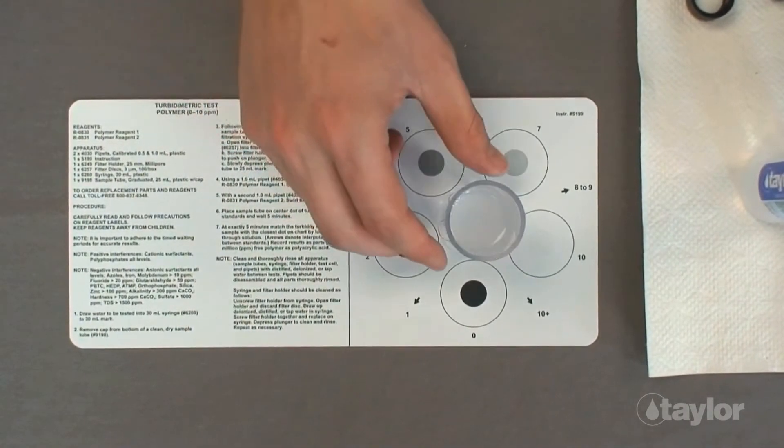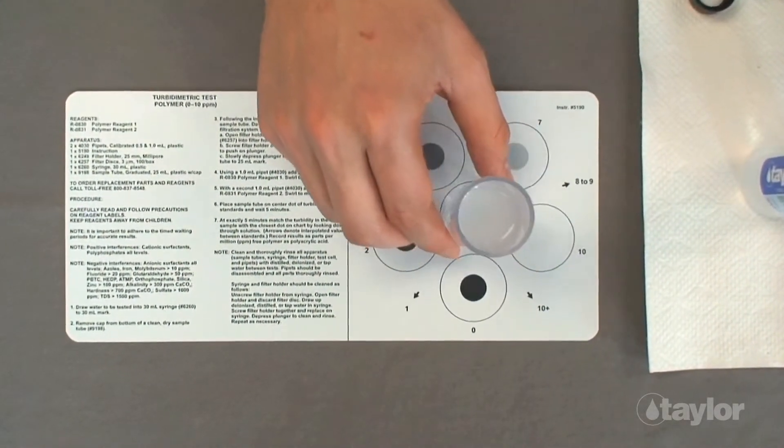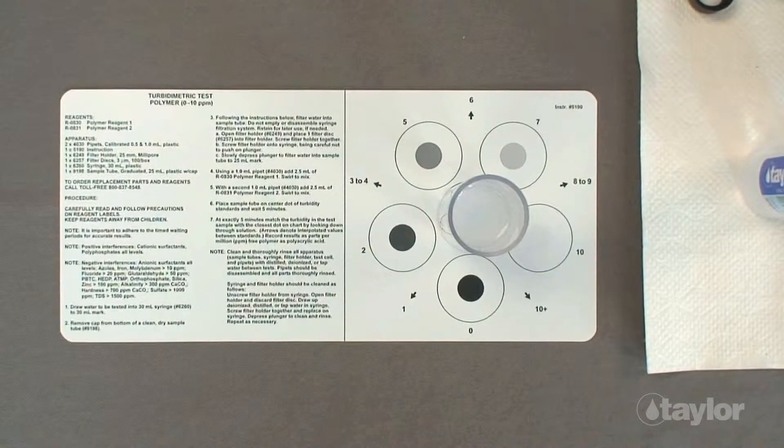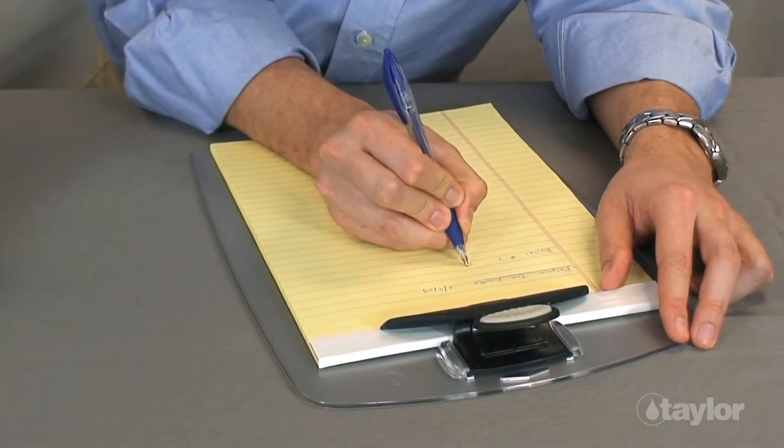At exactly 5 minutes, match what you see when looking straight down through the solution with the closest approximation on the chart. The dot under the sample tube will be partially or totally obscured by cloudiness that has developed in the sample. If the degree of this turbidity appears to be somewhat between two illustrated values, use the interpolated value indicated by the arrow. Record the results as parts per million polyacrylic acid, or PAA.